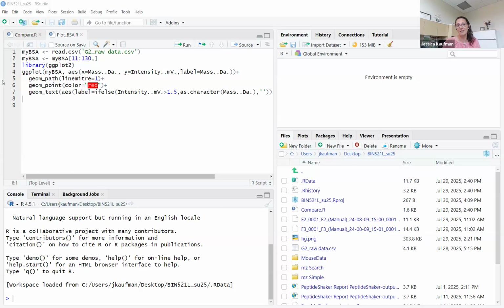But you can see when you use the G2 file that we're pretty close. And so you're going to see the 3 peaks for M over Z ratio around 66 kilodaltons, 33 kilodaltons, and 22 kilodaltons. And those represent the +1 charge, the +2 charge, and the +3 charge for the intact protein.